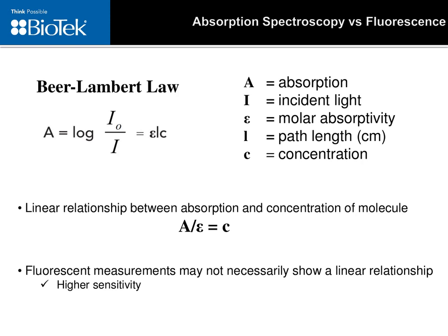So it's easy to see from this equation that the absorbance is related to both the characteristic molar absorptivity of the analyte, path length through the sample, and concentration of the sample. When solving the equation for the concentration, given a fixed path length and molar absorptivity constant, one can easily determine sample concentration once an absorbance measurement is taken.